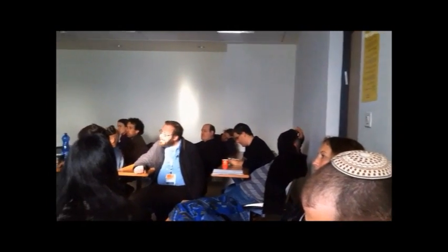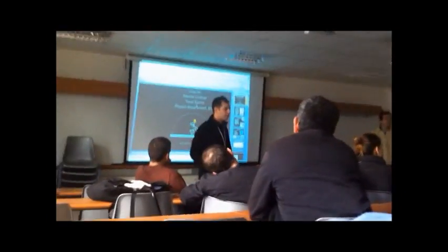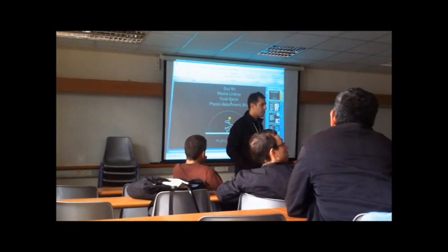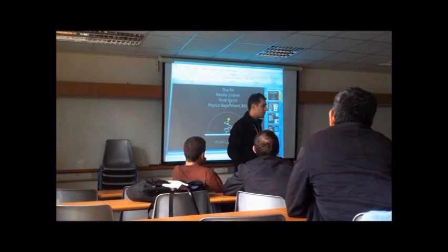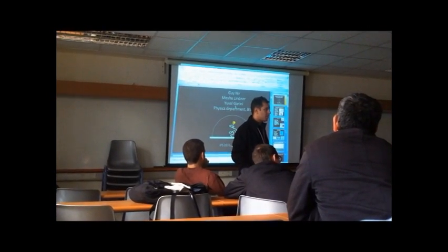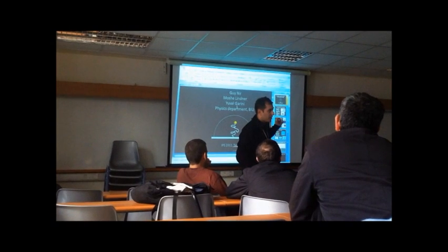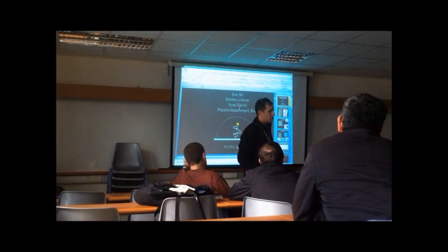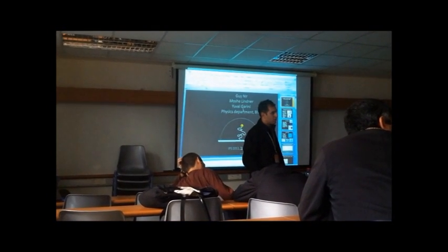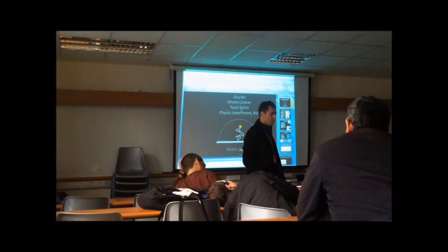The gold particle by itself is also probably negatively charged, right? So proteins are close to the gold particle. Negatively charged because of the gold. Probably they have to functionalize, stabilize it, things like that. It has to be charged, otherwise it won't be stable. So if it's negatively charged, you also have protein absorption to the gold particle itself, right? But it should be much smaller to really make an effect. You're talking about making an effect with the DNA? Just asking about modification, whether you have excessive absorbance of the protein itself to the gold particle. Oh. Is that a reasonable scenario?